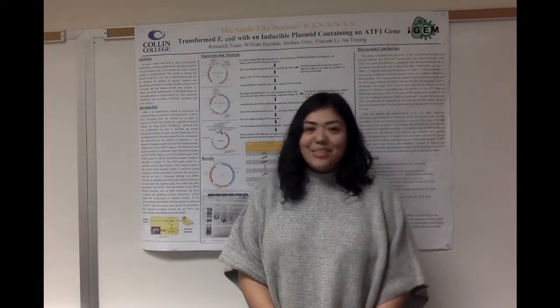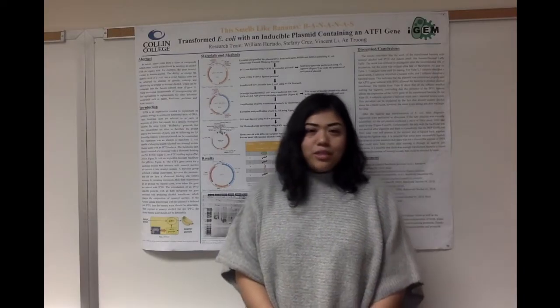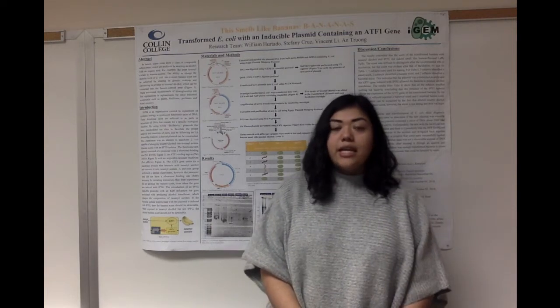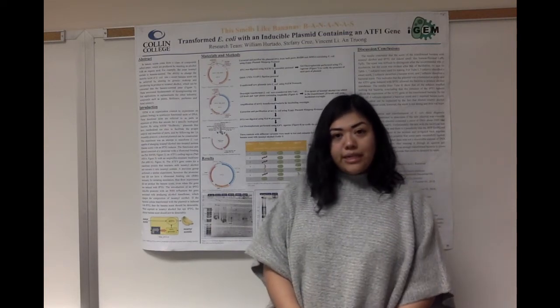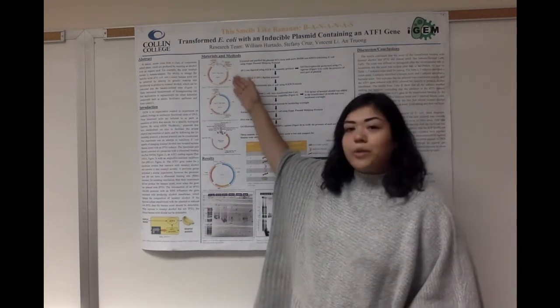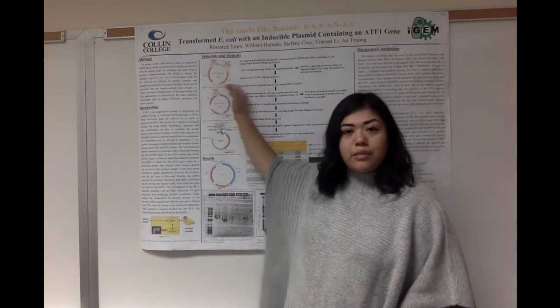experiment. iGEM was created to facilitate the ability to insert and remove parts from a plasmid. The plasmid we desired contained a promoter, a ribosomal binding site, and the ATF1 gene. The plasmid containing the promoter and RBS we will refer to as Part A.